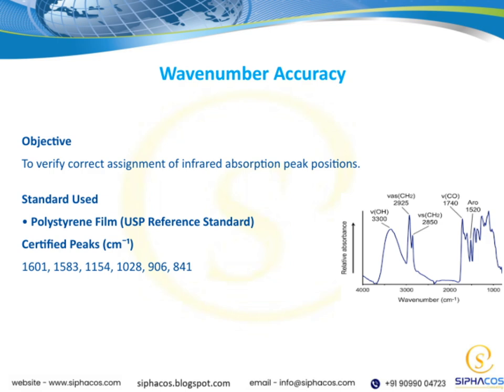By comparing our measured peak positions to these certified standards, we can confirm whether our instrument is accurately capturing the absorption peaks. This step is crucial because accurate peak assignment ensures the reliability of our spectral analysis and subsequent interpretations.